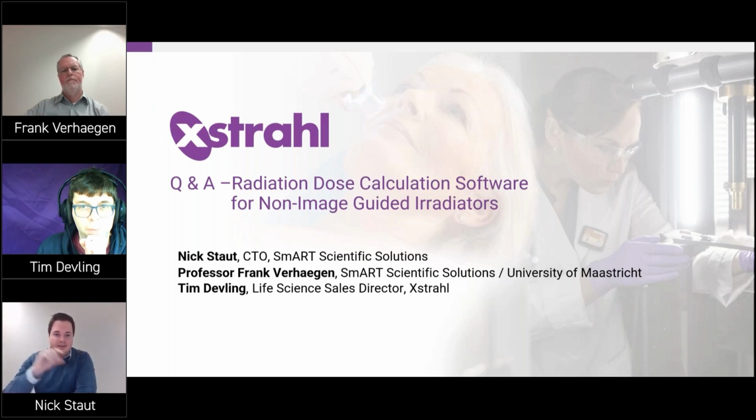In this example, I had the cells as soft tissue, then a layer of water above it, and the plate was PMMA. But you can change those materials. I think there's around 18 or 20 different materials, but it's relatively easy to extend that as we get user feedback.